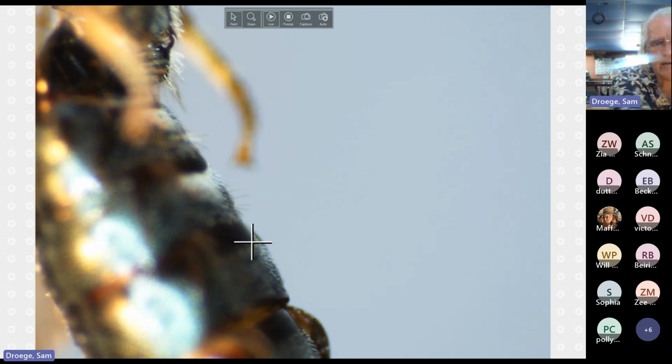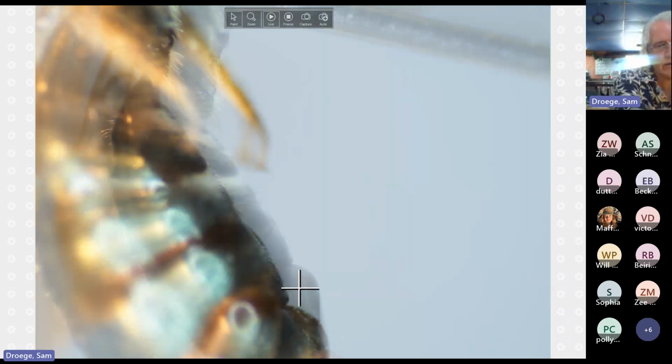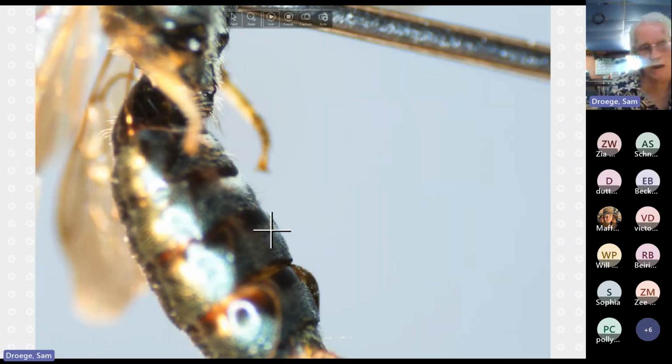We'll see in calcarata that there are numerous hairs upright here, and that they have a relatively bright white aspect. So even if there are hairs here, they tend to be on the amber end of the spectrum. But basically, they look relatively smooth, almost no hairs down here in this specimen, and that's the best way to tell the two species apart.